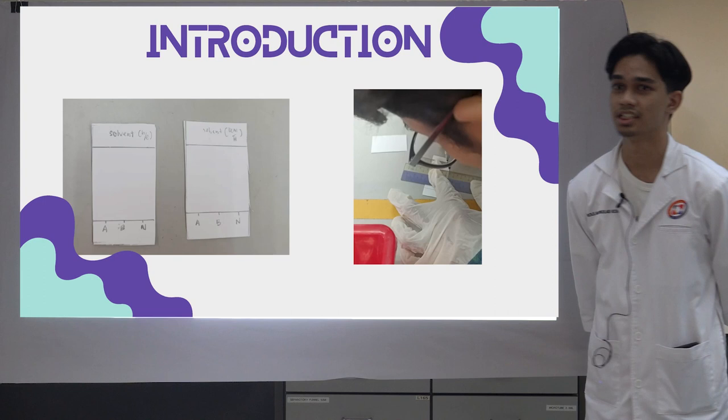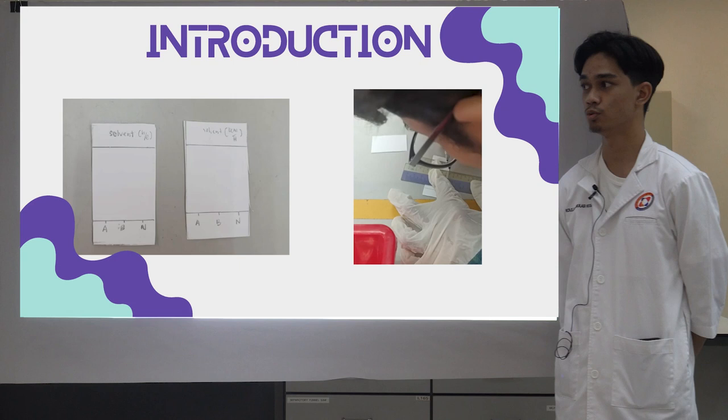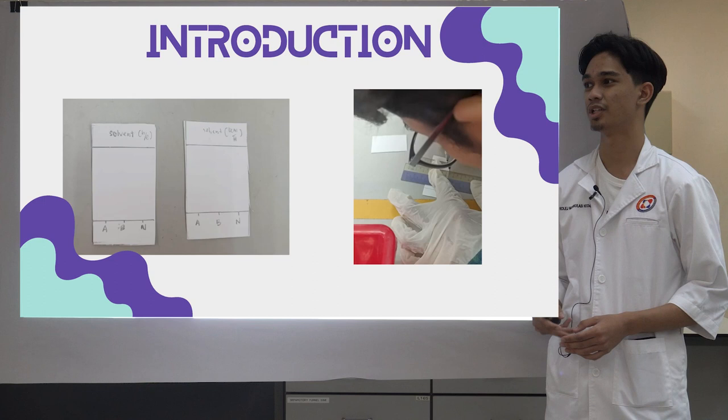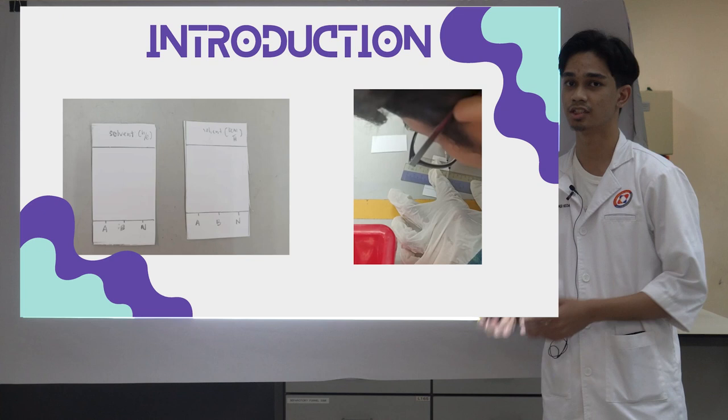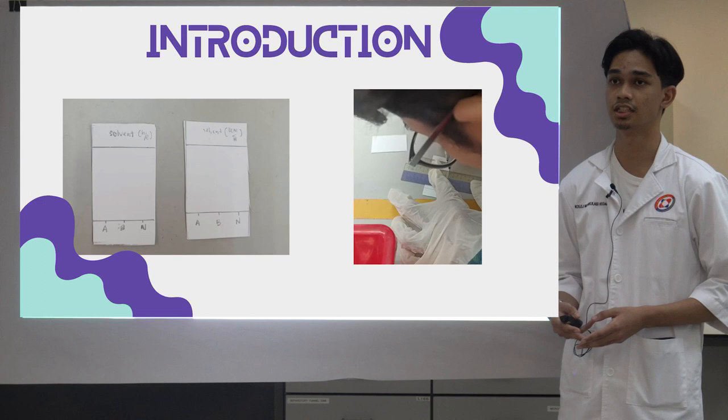So what is chromatography itself? It is the separation of a mixture into components, which is also known as a separation process. There are two types of phases in chromatography, which are the stationary phase and the mobile phase. Using those two phases, we create two types of chromatography, which are liquid-liquid chromatography and liquid-solid chromatography. Between those two phases, components will migrate depending on their affinity to each phase.